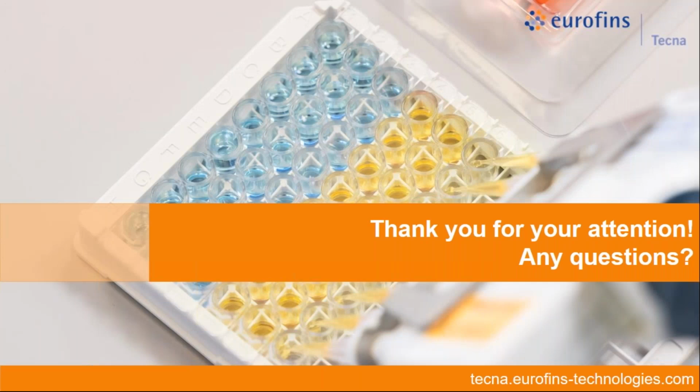I don't know, Evelina, if we have time for questions, if you were able to collect any from the audience. Yes, so thank you, Julia, for the very clear presentation. And yes, we have some questions, so I would like to proceed to read you some of them. First question, do you have a kit specific for aflatoxin B1 only?